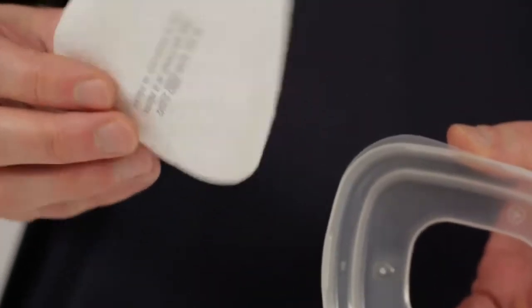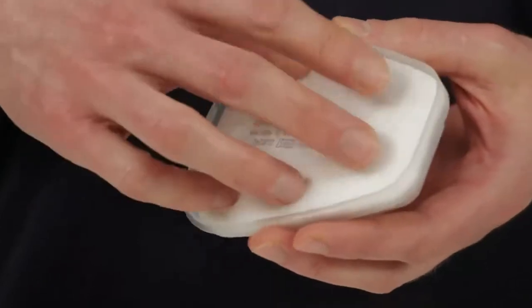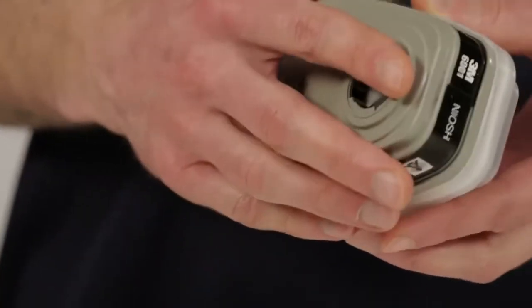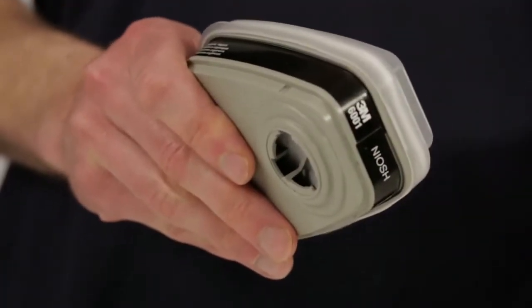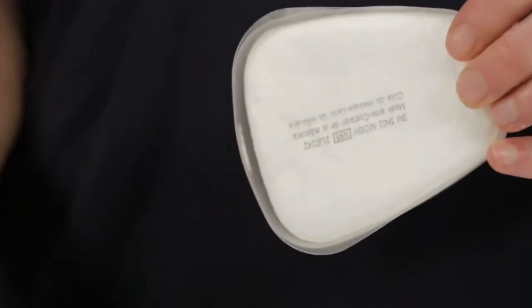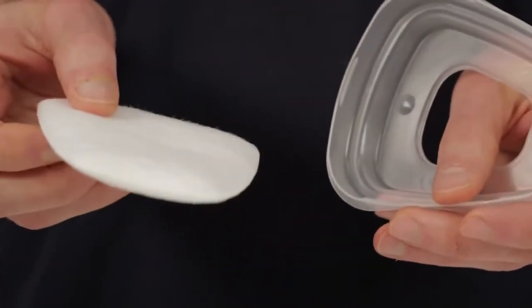To attach the 3M particulate filters 5N11 or 5P71, place the filter into the retainer with the printed side facing away from the retainer. Press the filter retainer firmly onto the cartridge until it locks securely. Correctly installed, the filter will completely cover the face of the cartridge with the printed side facing the cartridge. To replace the filter, remove the retainer by lifting on the tab.